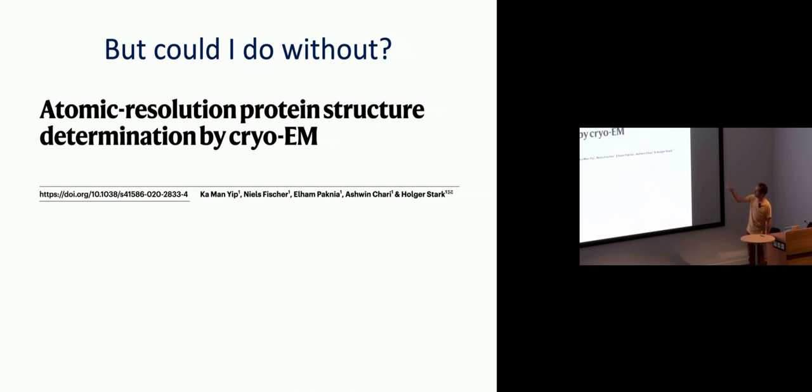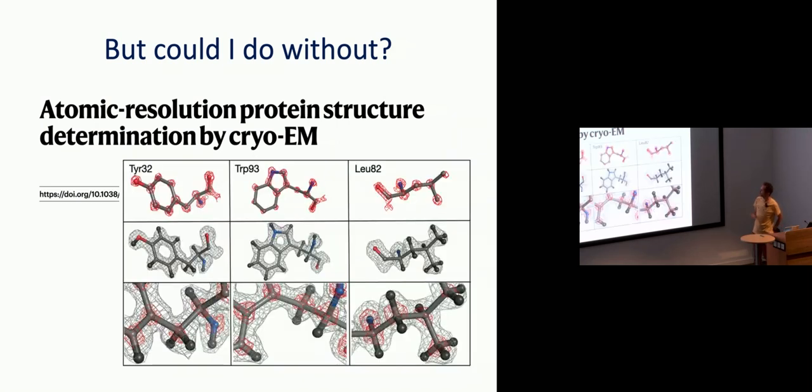They published their paper back-to-back, more or less, with ours on a similar atomic resolution apoferritin structure, also 1.2 something, but they did not do the optical aberration correction in the image processing, because they had a hardware corrected microscope.